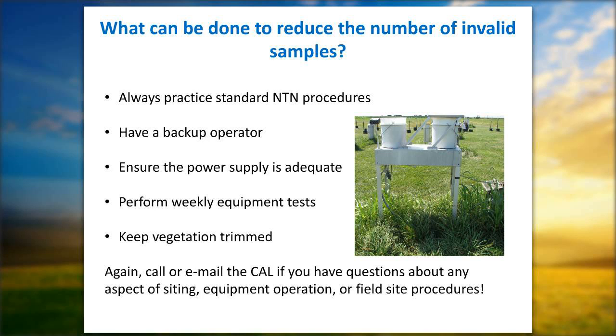We got a question here, and it's an excellent question about bottle leakage. As director of the lab, this is something that plagues us, and we talk about it once a month. We do have a high frequency of leakage from our one liter NTN bottles. We know about this. That is one thing I didn't mention, so I'm glad it gets brought up.